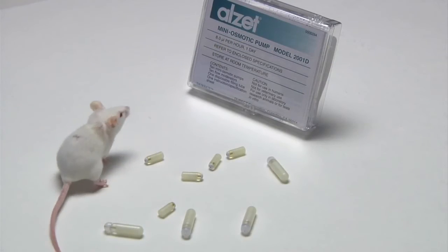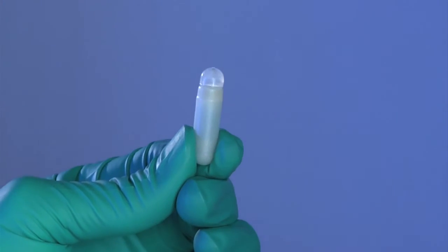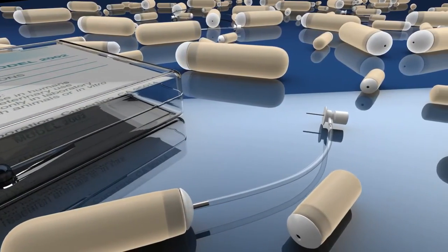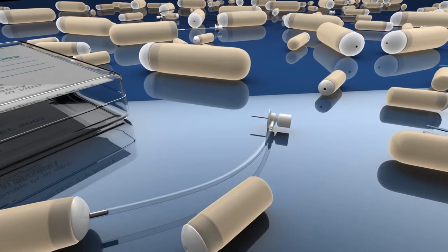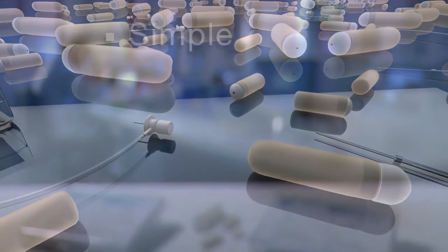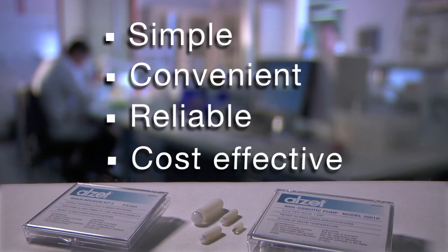In 1977, ALZET pumps pioneered the concept of controlled bioactive compound delivery in the research laboratory. Today, the ALZET osmotic pump has emerged as a proven and valued research tool enabling revolutionary discoveries by providing simple, convenient, reliable, and cost-effective continuous dosing of laboratory animals.